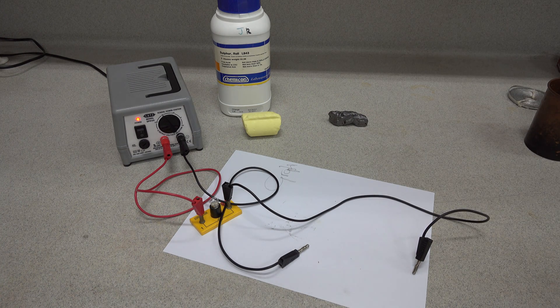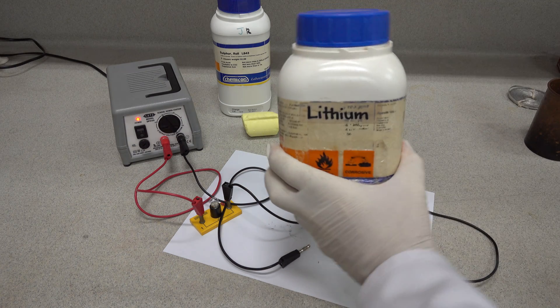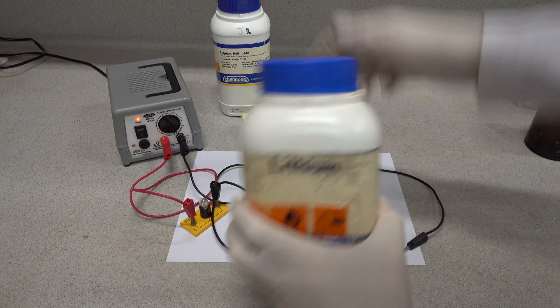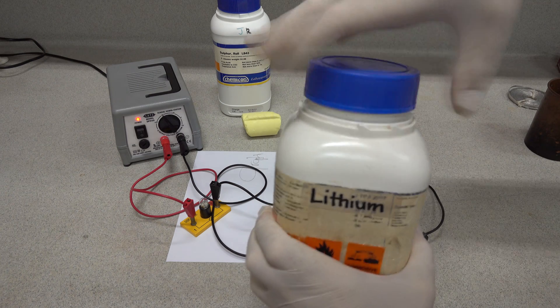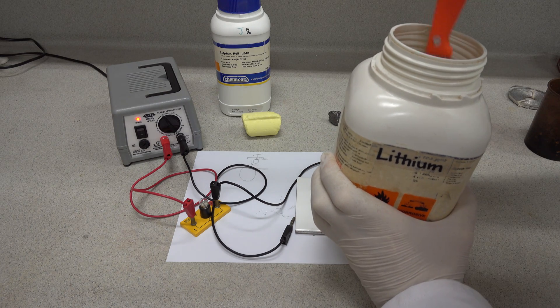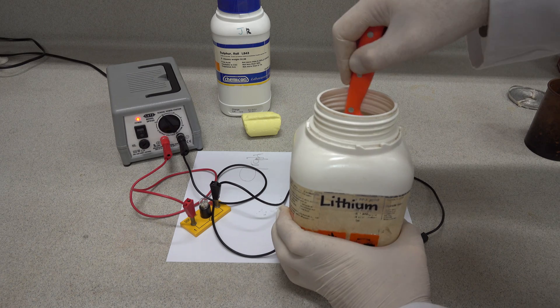Next, we have a rather interesting element. This one is a group one metal. This one is lithium metal. And it's very reactive. It's stored under oil. And we need to take it out of the container in the oil and have a look to see if it conducts electricity. So let's get the lithium out.